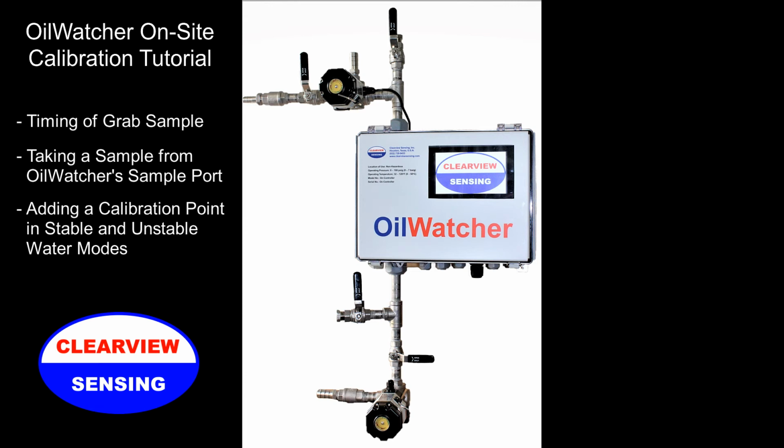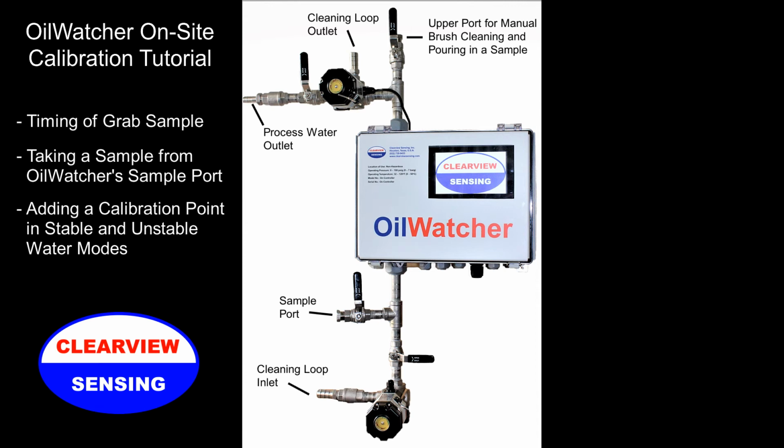Let's take a moment to look at some of the water connections on OilWatcher. From the top, we have the cleaning loop outlet, upper port for manual brush cleaning and pouring in a sample, process water outlet, sample port, the cleaning loop inlet, and the process water inlet, which is below the valve.